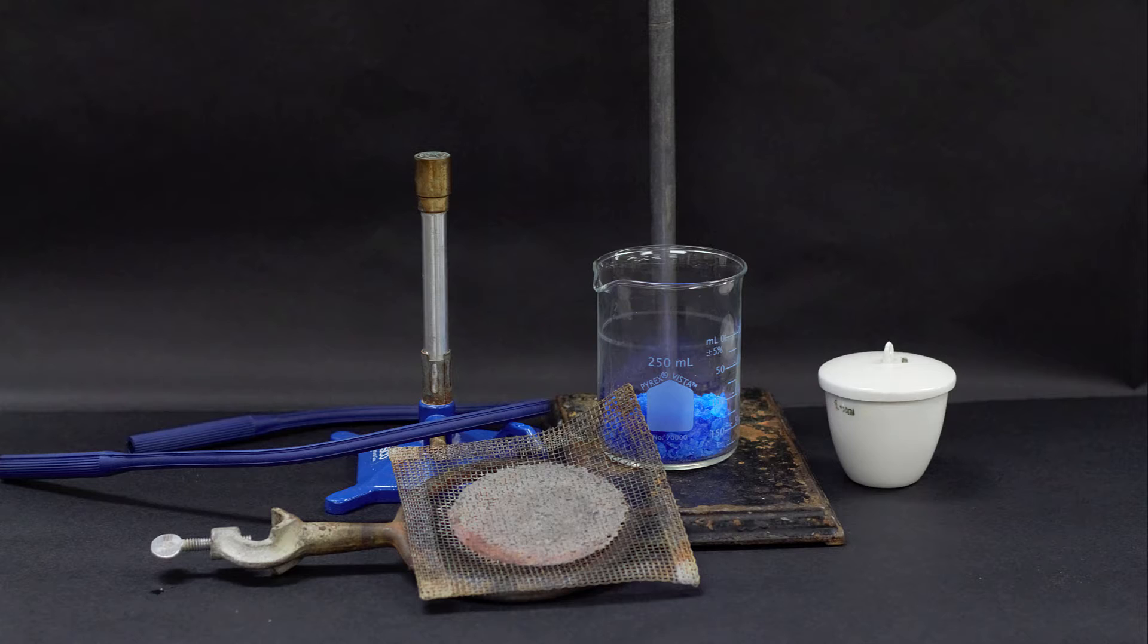For this lab you'll need the following materials: a Bunsen burner, a ring stand and a ring with a ceramic plate, a crucible with a lid, a pair of tongs, and some copper sulfate or an equivalent chemical provided by your instructor.